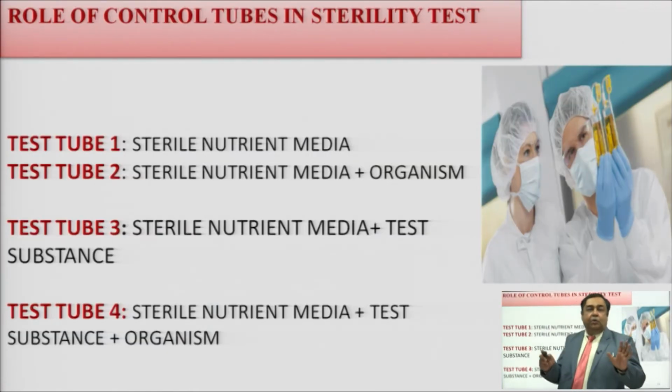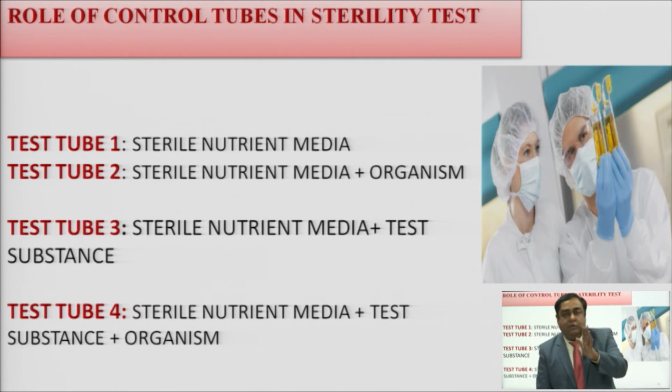Now, there are certain control tubes. I hope up to this is clear to all of you, that we need to simply pass the solution. If it is insoluble, we need to solubilize it with the help of diluting fluid, which I have told you earlier, pass it across the filter, and then that filter has to be immersed either in a bacteriological medium, or in a fungal medium, or in an anaerobic medium. Now, apart from this, we have to take some control tubes.